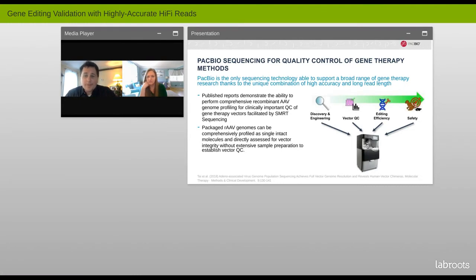So many labs over the years have been intensely focused on developing AAV strategies, right? A lot of aspects that these folks have started to be interested in have depended on long reads. I've been around for a little while now and have been helping with these AAV approaches for over 5 years. And we've seen the strategies and efforts broken down into several phased approaches, whether it's discovery and just general engineering, or groups that are aimed at vector design and trying to get high quality vector QC. Others check the platforms and develop their editing efficiency and make sure that the changes that they're making are actually there, right? And making sure that they're building out some of that for safety, right?